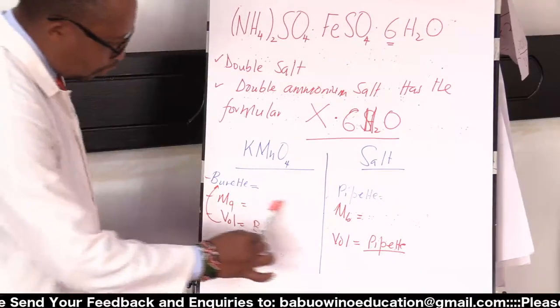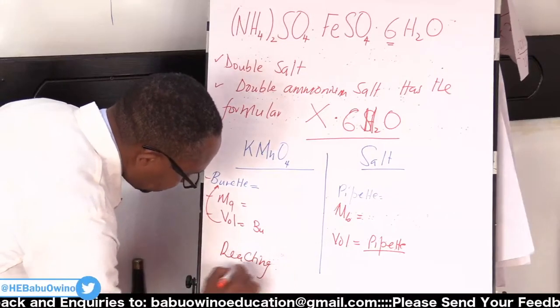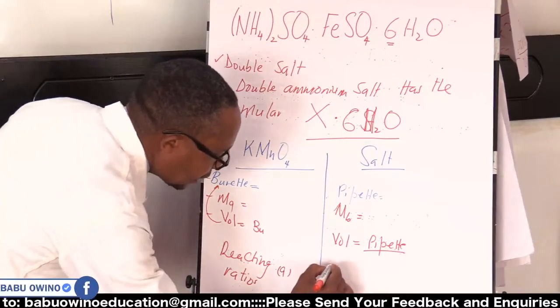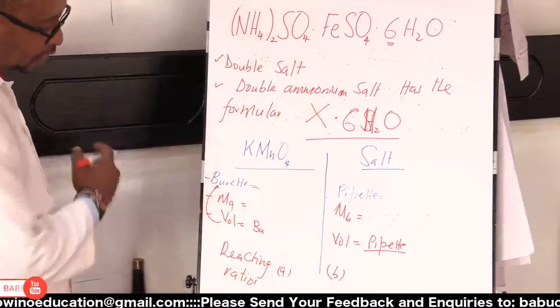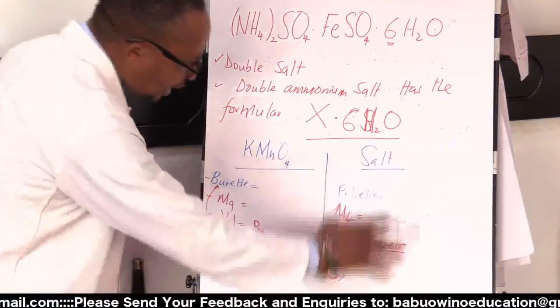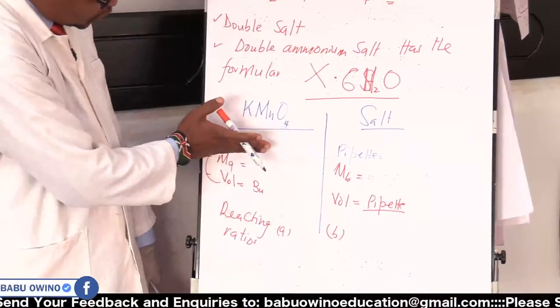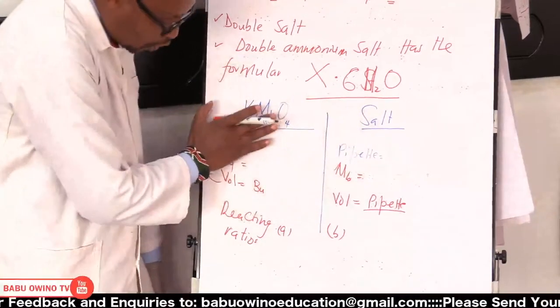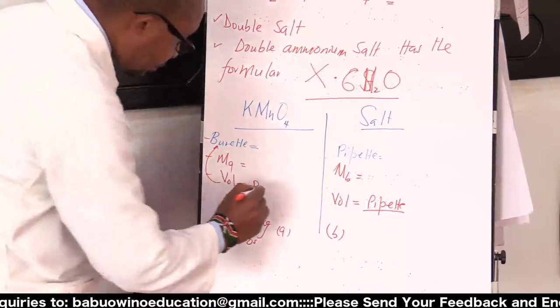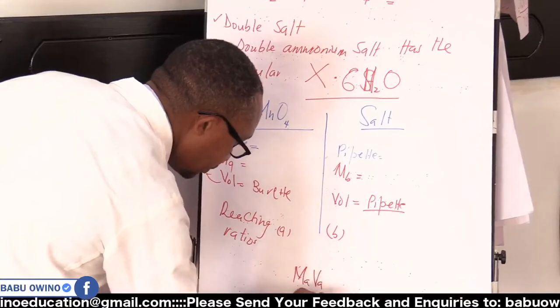And when you're given one of them, and you're given the ratios, reacting ratios, which I'm calling here A and B. The solution that you write to this side could be A. What you write to that other side could be B. So here you fill in what you do in an exam. Just have your equation, have what is on the burette, have what is on the pipette, all the information on the solution that you have from the burette indicated there. Then what we are saying, this formula will always work for you.